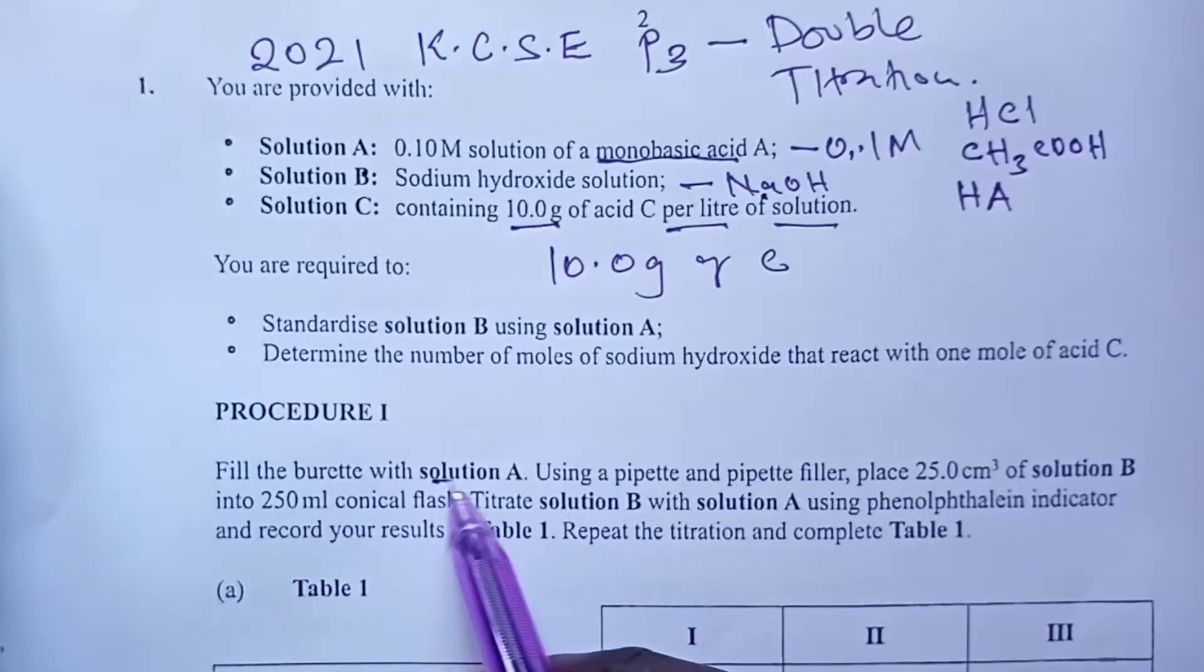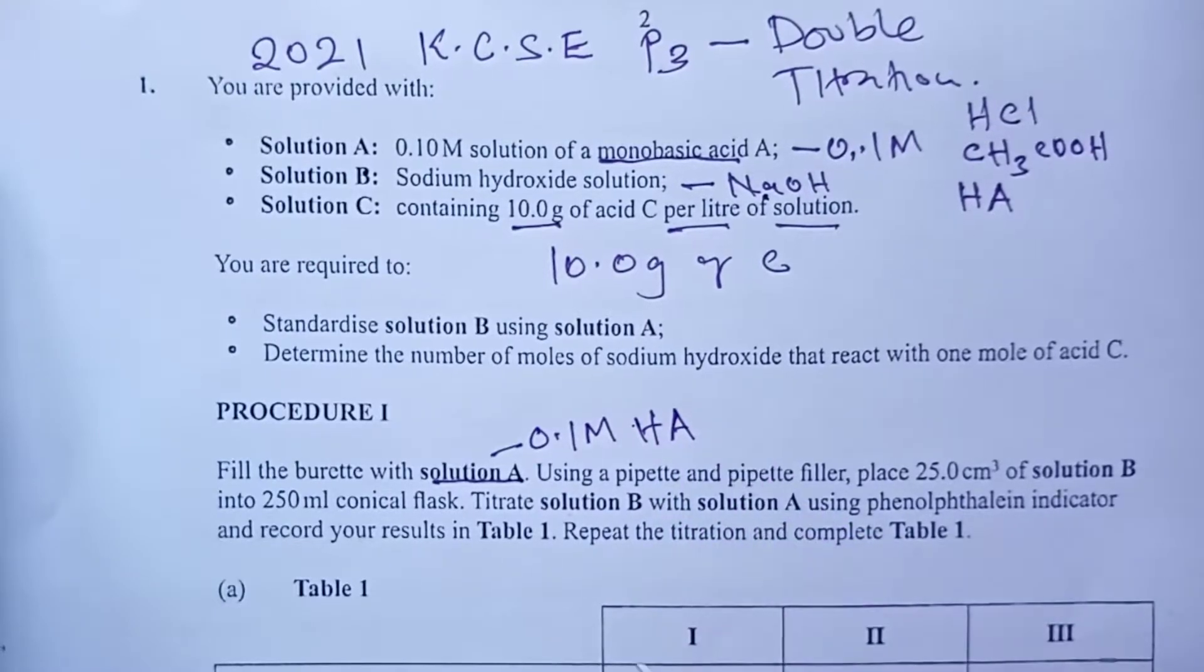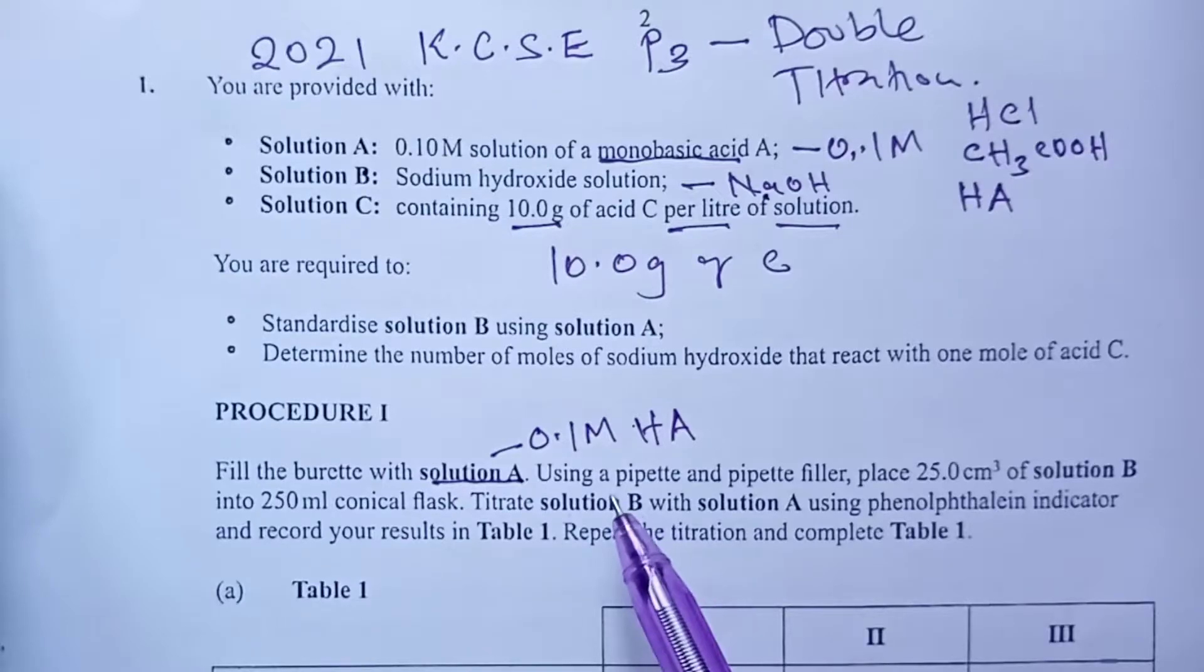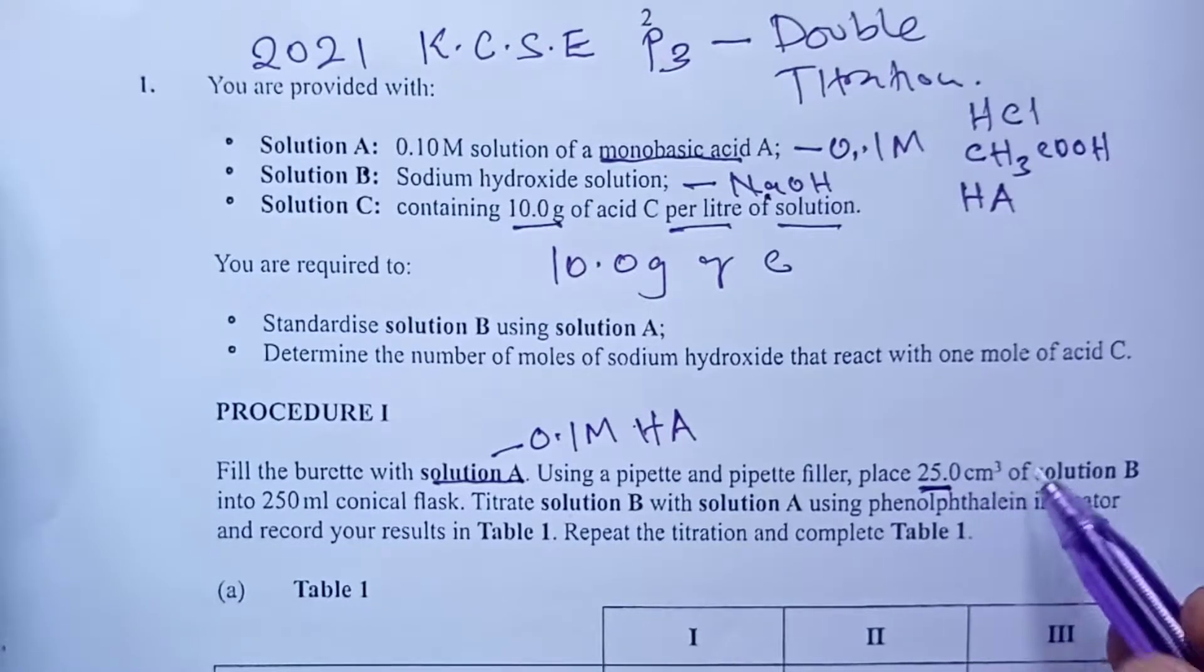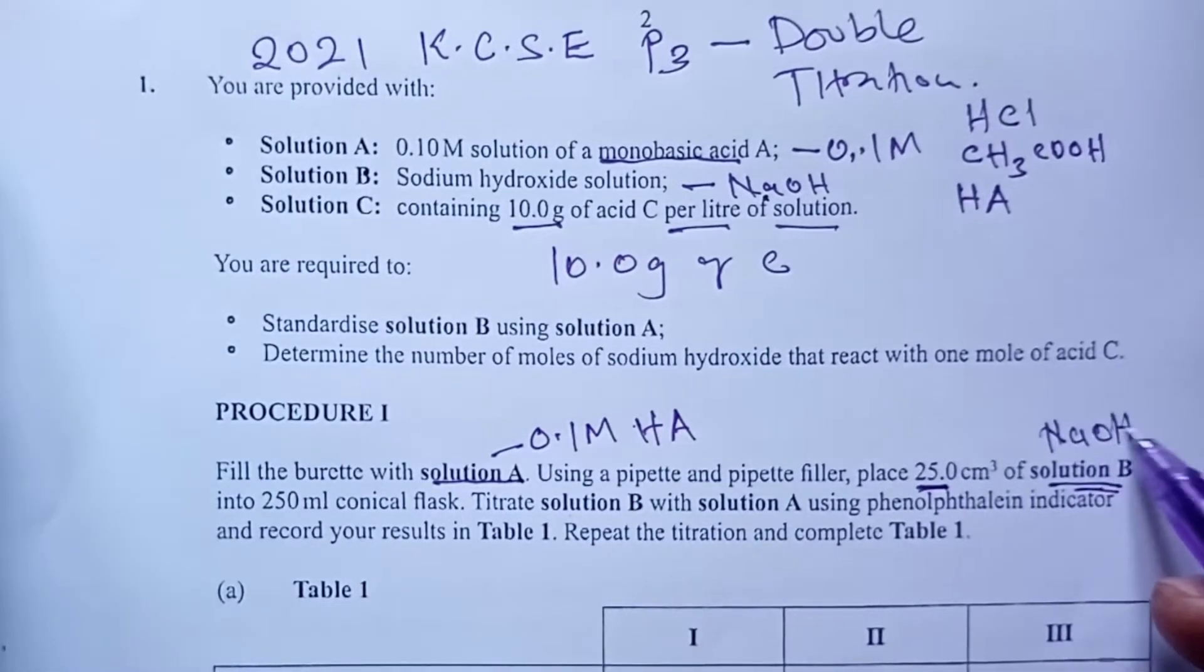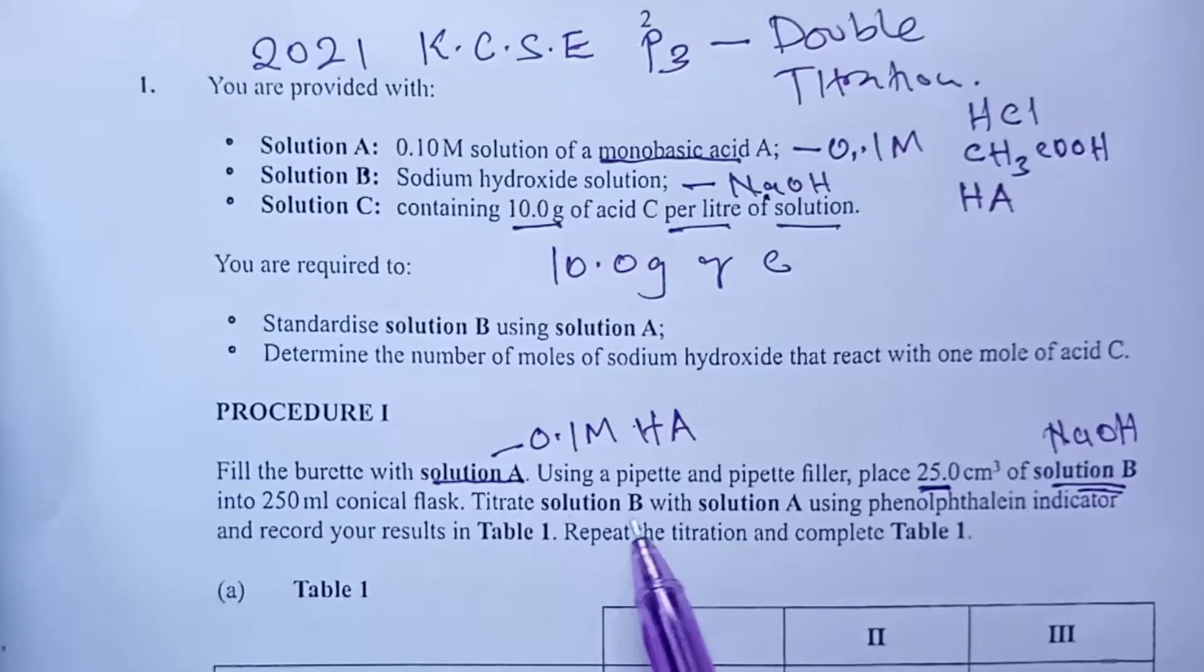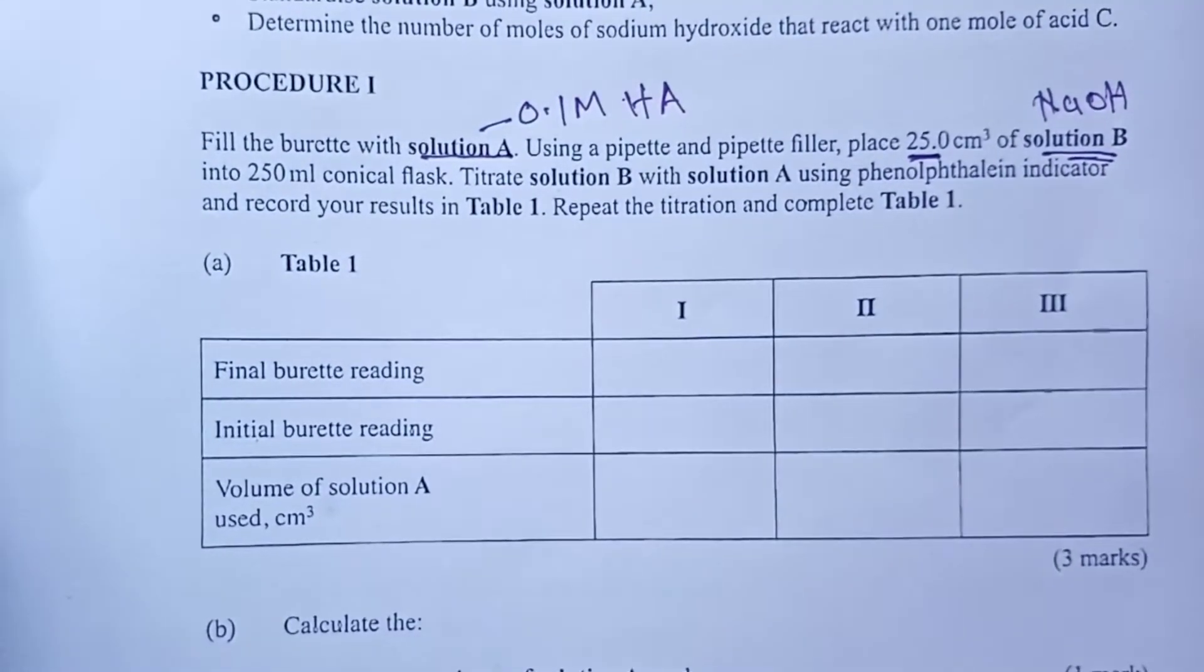Fill a burette with A, our A remains 0.1 molar, let's call it HA for now, a monobasic acid. Then we were asked that using a pipette and a filler, place 25, we mark these volumes because they are very useful in calculations, of solution B, B is sodium hydroxide, into a 250 conical flask. We were then asked to titrate B with A using phenolphthalein indicator and record results in table one. We were to repeat the titration two more times so as to complete that table.